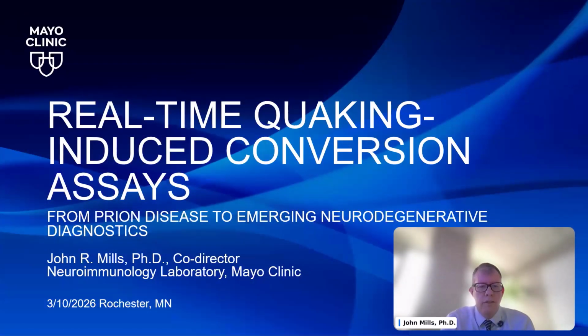Thank you all for joining this morning. Today I'm going to be speaking about RT-QuIC assays, particularly in their role in the diagnosis of prion disease, but we'll spend a little bit more time at the end talking about other potential applications.